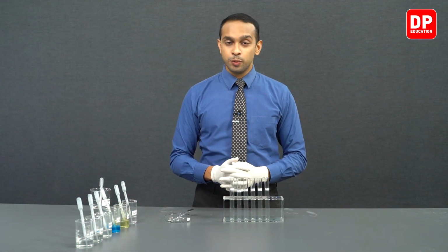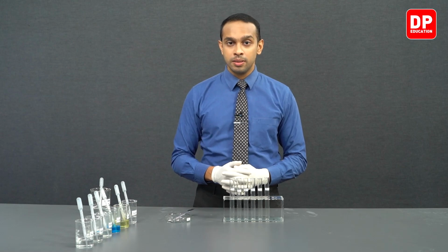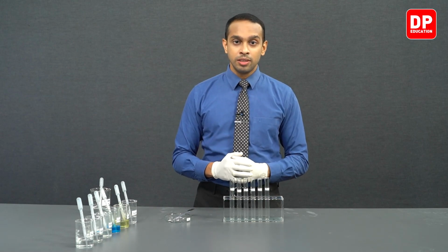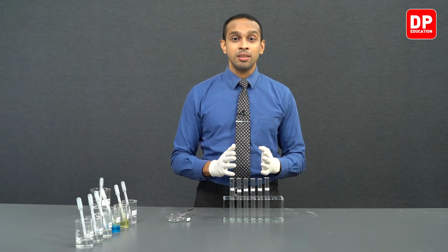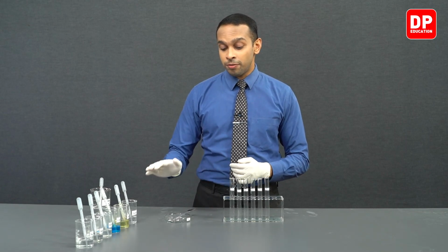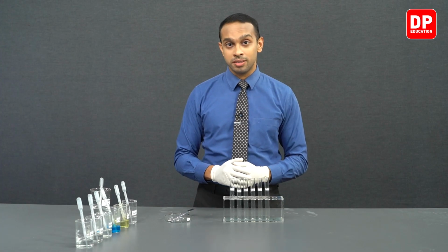Now students, let's move on to the final part of our experiment. In this part of our experiment, we are going to observe how zinc metal would react with different solutions we have over here.